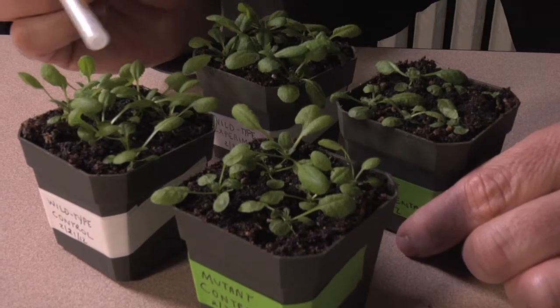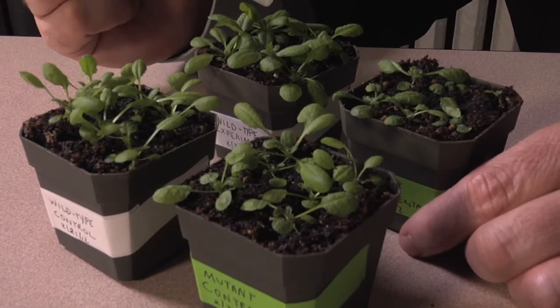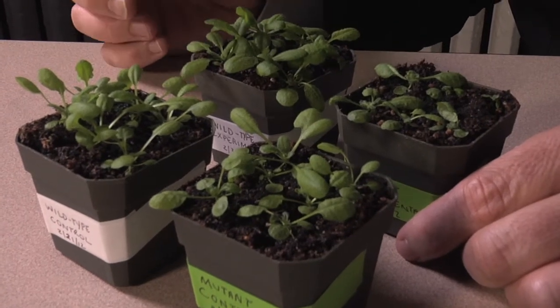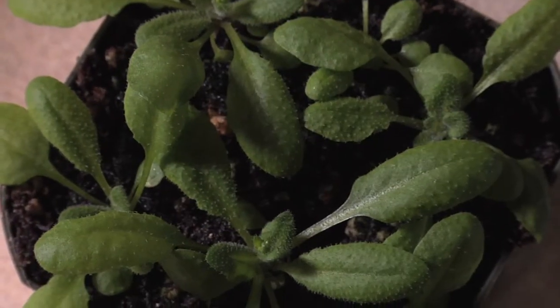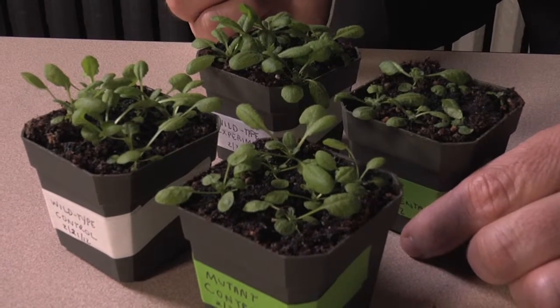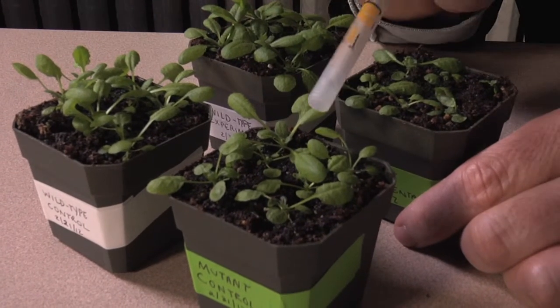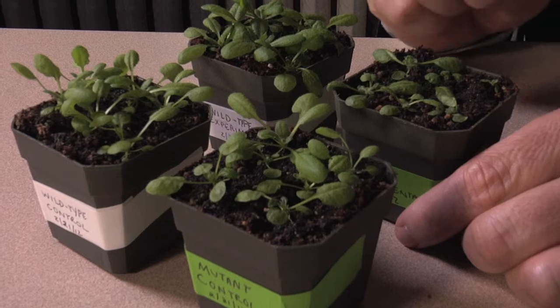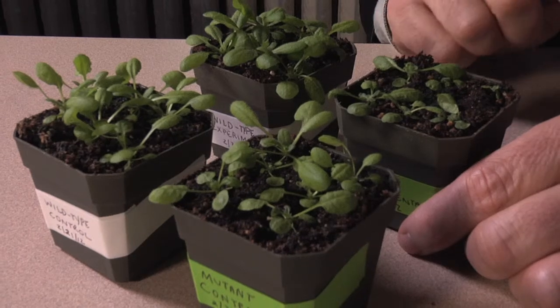Now if I look over here at the 2 wild type plants, here's my experimental and here's my control. I can see under higher light conditions that the wild-type plants look much more robust. They're larger, darker green. I can see the flowering bolts emerging from the center of the rosette. And I know that these plants are well on their way towards their reproductive phase. So now I've seen what's the effect of changing the environment, what's the effect of disabling the gene. I can look over at my experimental mutant pot and I can ask, is that response different to the high light conditions? And it certainly does look different.